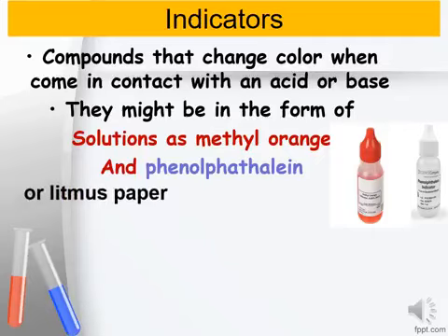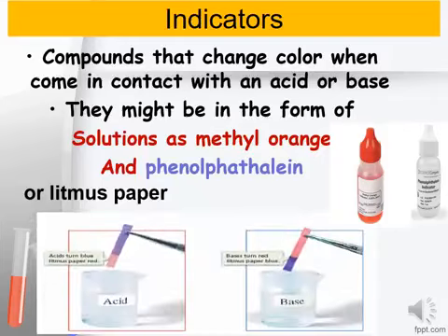The second method for qualitative measuring of pH is the litmus paper. We have mentioned that when the blue litmus paper turns red, then it is acidic. When the red one turns blue, B for basic, then this solution is a base. When the red and the blue one do not change, then it will be neutral.